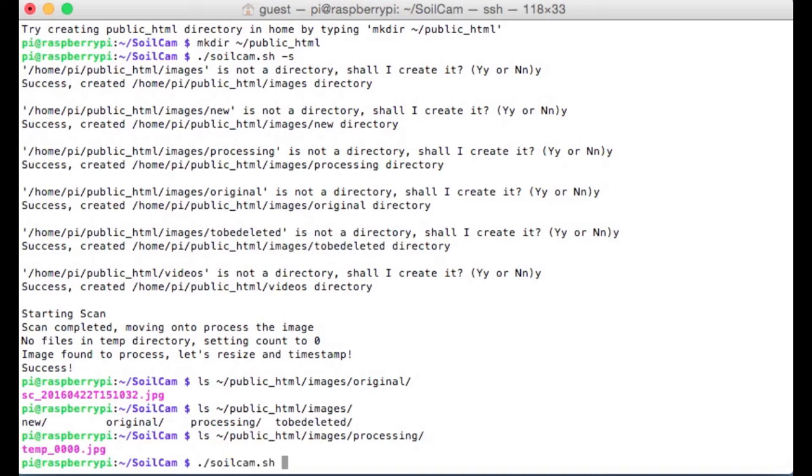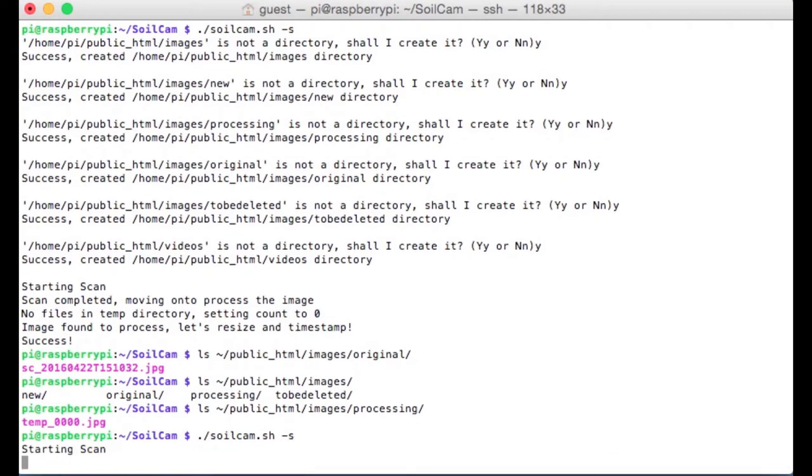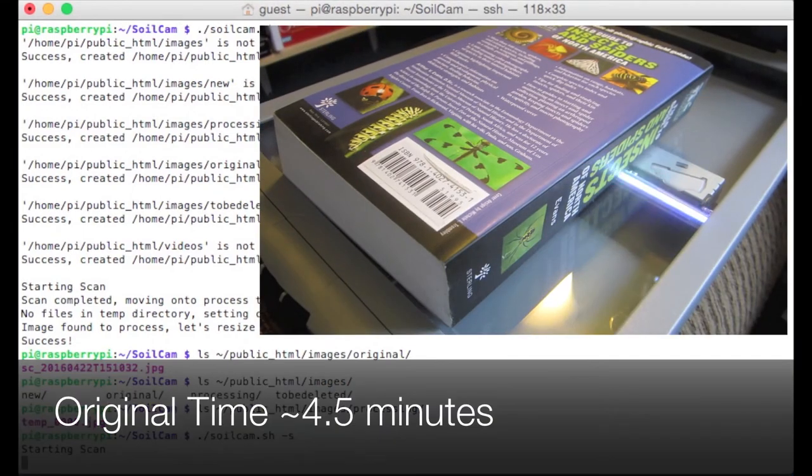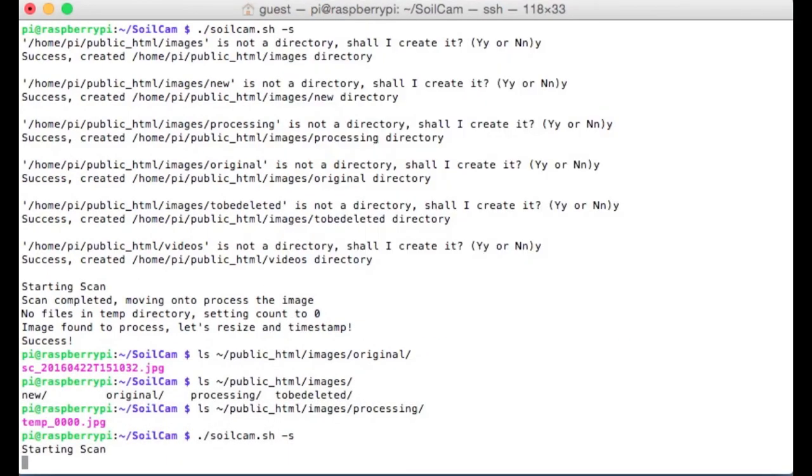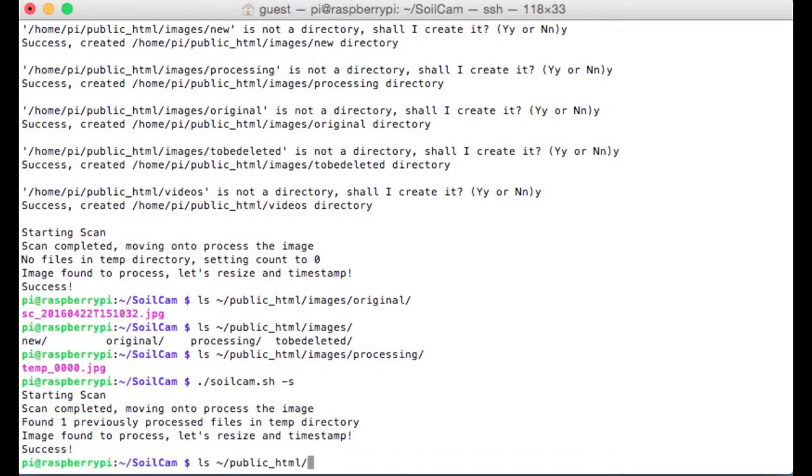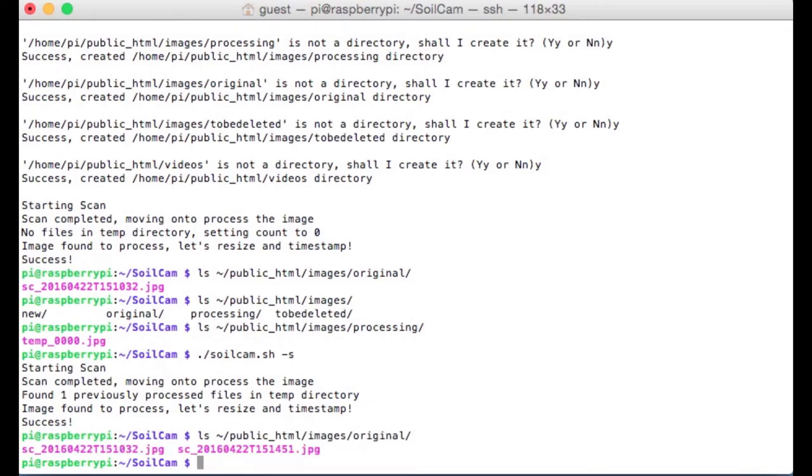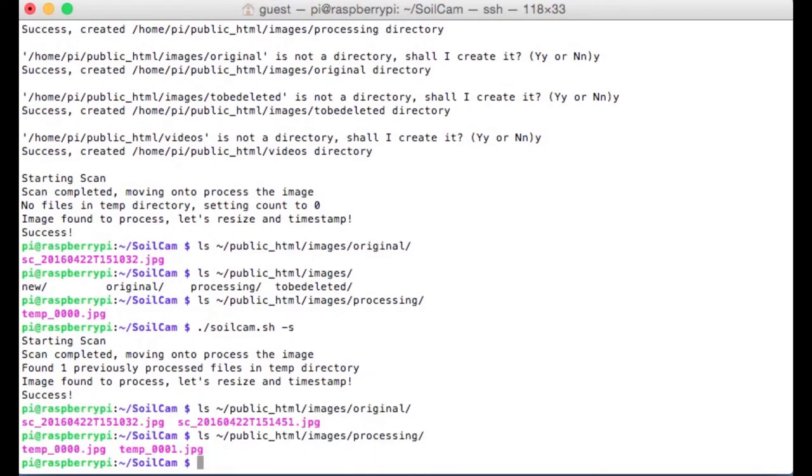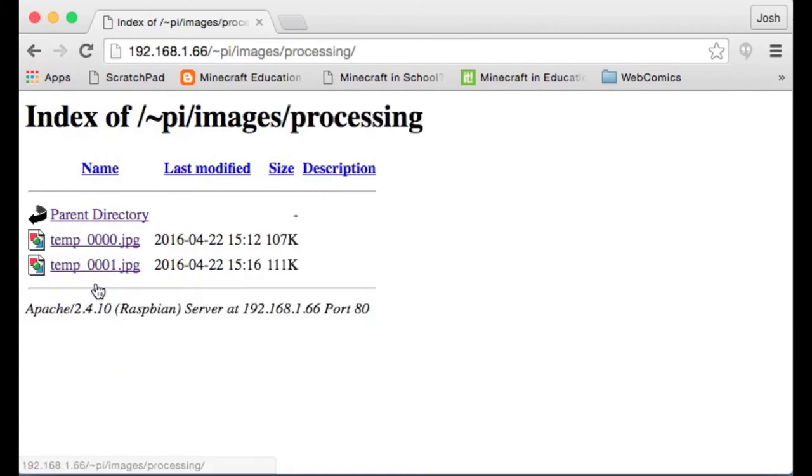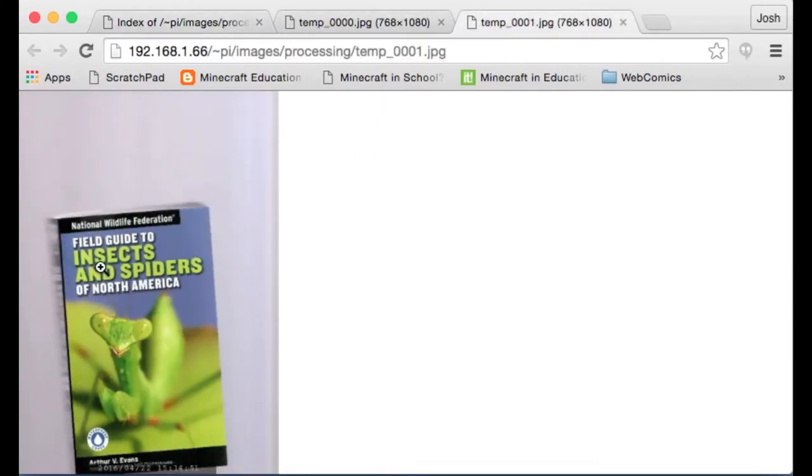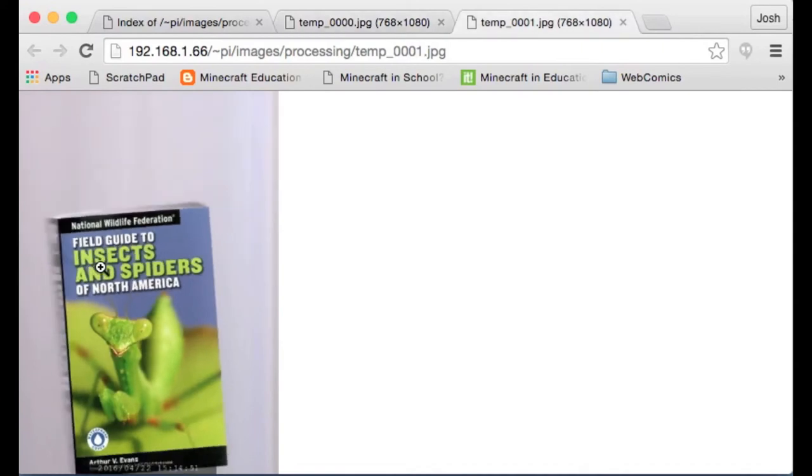Let's go ahead, and if you did have something on your scanner, go ahead and shift it a little bit. Otherwise, go ahead and put something on your scanner, and let's run one or two more scans. You'll notice this time it doesn't ask you about those directories. It knows they've been created. It still checks it each time, but if it finds them, it doesn't ask you to create them. So that just finished the scan. It found a previous file in the temp directory, and it found a new image to process. So it's going to go ahead and convert the newly processed image into a slightly lower resolution image as well as timestamp it. Again, if we check the public HTML images original directory, we see two files in there. And if we check the processing directory, we see two temp files in there. Slight shift in each image.